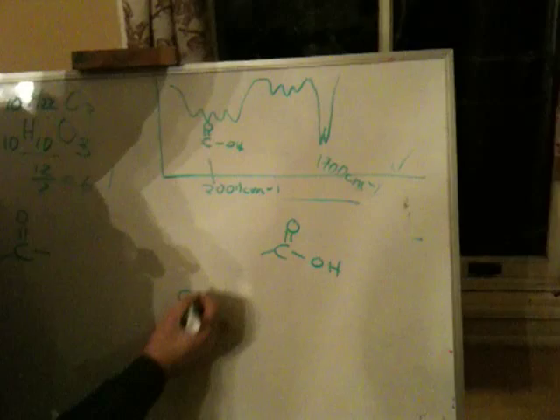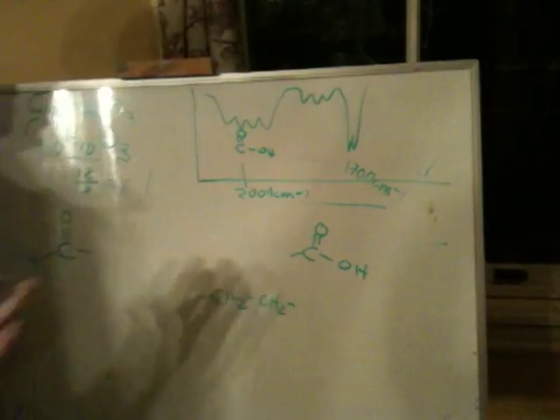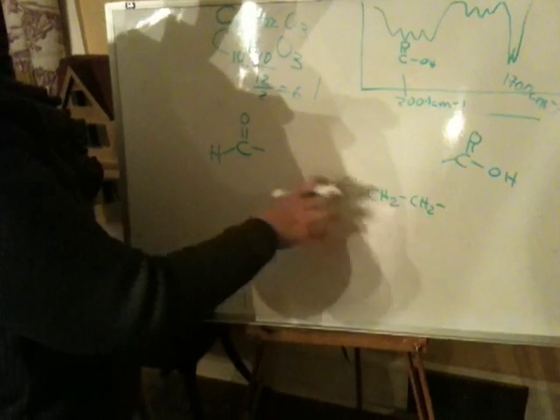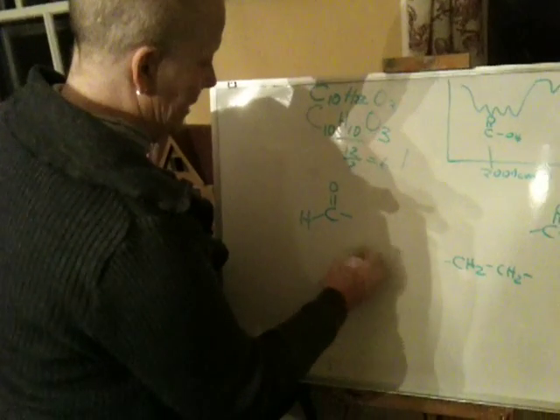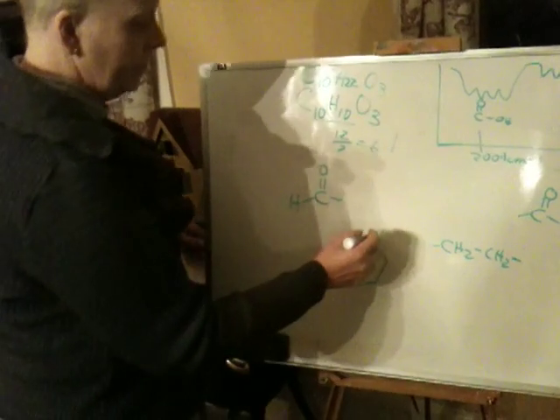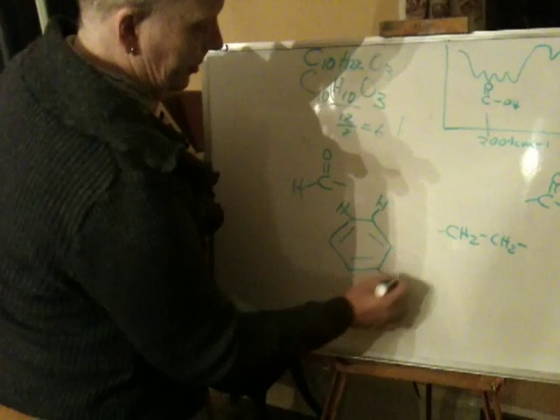This has 1 connection on it, okay? We established that we had this little piece, a CH2. There was nothing too spectacular about its positioning. They were both at about 2, which means they were probably near double bonds. The other thing we have is an aromatic ring, probably a benzene, with hydrogens that are likely to be disposed in this manner.